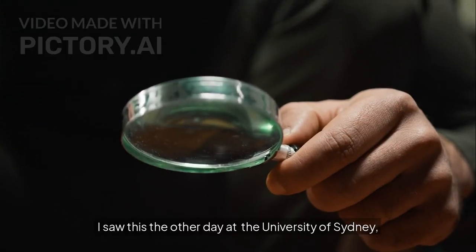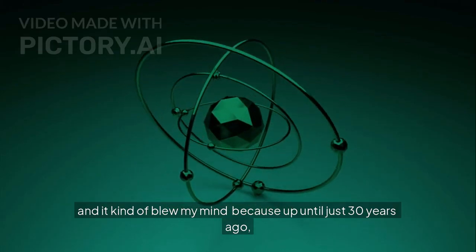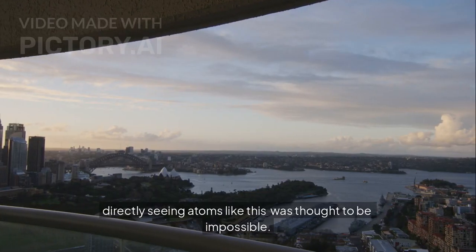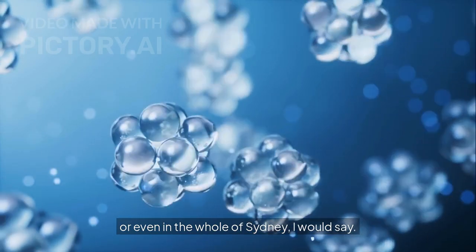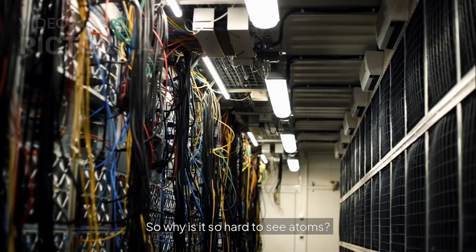I saw this the other day at the University of Sydney, and it kind of blew my mind because up until just 30 years ago, directly seeing atoms like this was thought to be impossible. The rooms that you're going to see here are perhaps the most shielded rooms on campus, or even in the whole of Sydney, I would say. And perhaps also the most expensive. That's wild. So why is it so hard to see atoms?